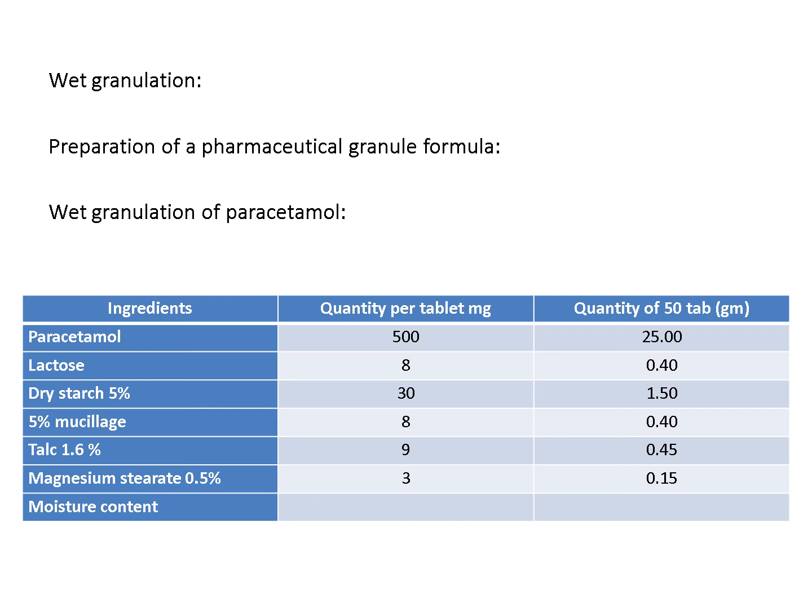Press it through a sieve with mesh number 14, and these granules are wet, so put them in an oven at a temperature less than 56 Celsius, and dry them to a moisture percentage of maximum 2%. So after drying these granules, we will add the rest of the dry starch, that is the disintegrant, the most important part. Then we will use a lubricant, flow promoter and anti-adhesive.